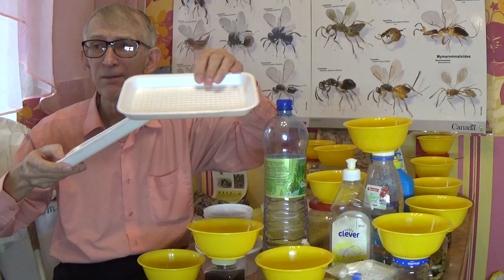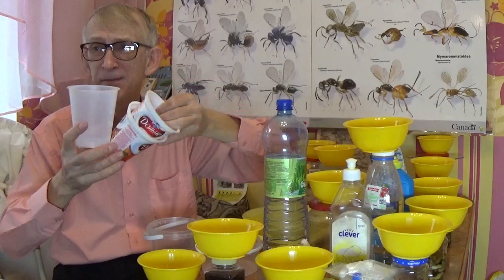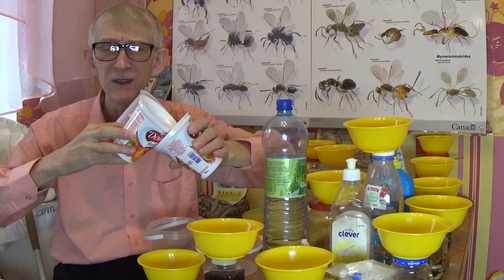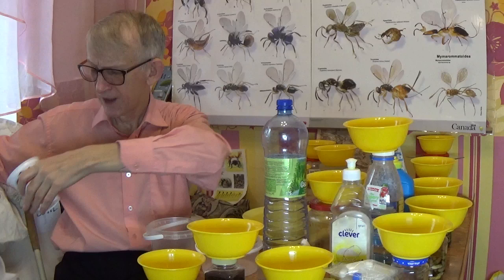White or blue plates are less effective for flying insects, especially for parasitic Hymenoptera. Large plastic glasses can be used too, but they're big, so large arthropods and invertebrates will be drawn in as well, creating a mess — a lot of garbage you need to carefully sort through to find the material you need.